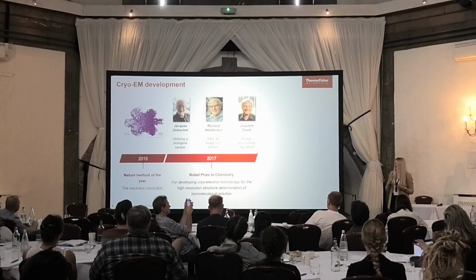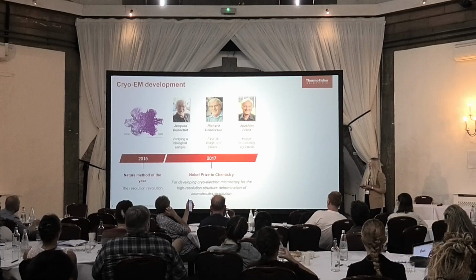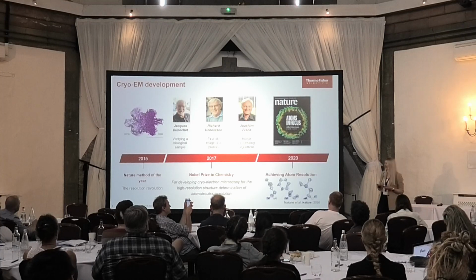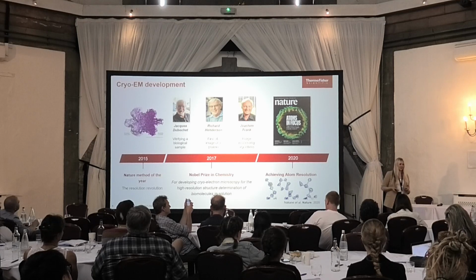Of course, the next big milestone in cryo-EM development was the Nobel Prize awarded to the 3 pioneers of the technique that everybody is very familiar with. And then if we fast forward again by a few years, we had another really important milestone, finally achieving atomic resolution in a protein structure.